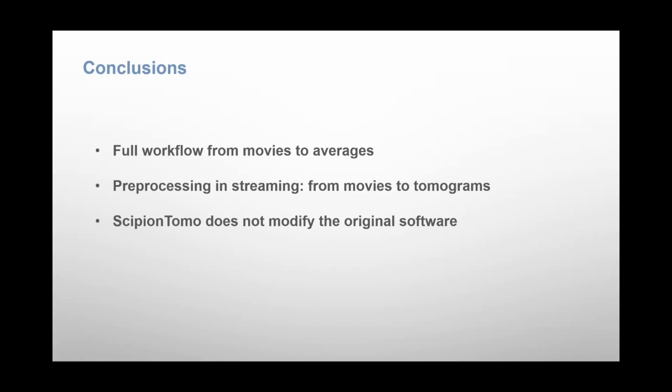And something that I like to insist is that Scipion does not modify the original software. It is the original software, but it adds an integrative layer with a nice interface and forms to visualization tools to make your image processing more simple.